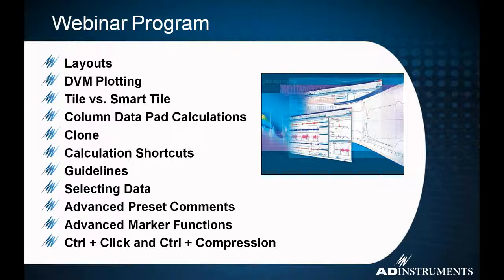If you're familiar with some of these things, that's wonderful. I intended this webinar to be great for both introductory level people as well as people who are very comfortable and advanced users in LabChart. I promise you there's at least a few things in here you haven't seen or used. And again, one of the struggles that I had in creating this is that the list of things we came up with are pretty random. They're scattered, and there's a lot of things all over the place in the software that we're going to be talking about today.